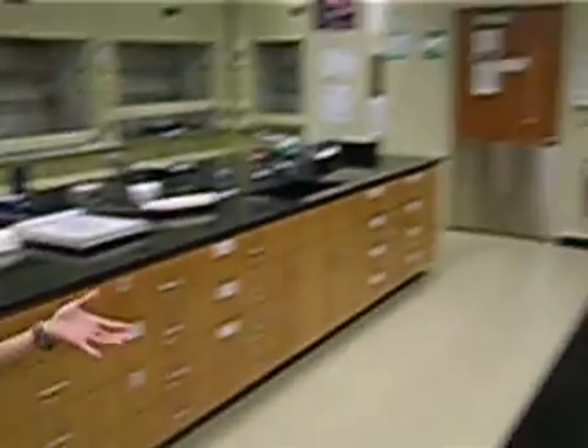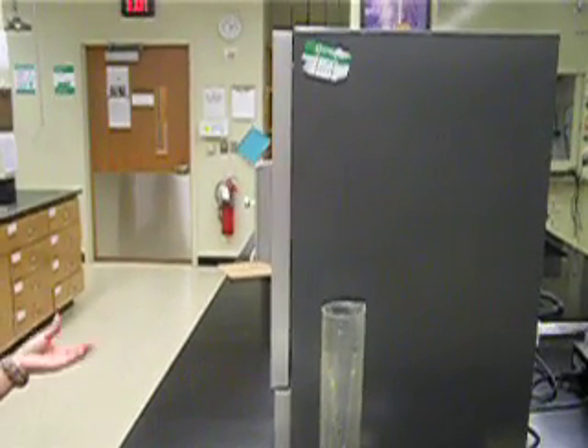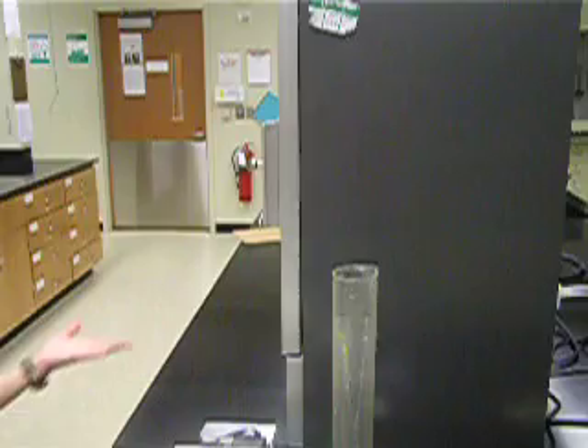Now we're going to move to the oven. This oven is used to dry out your glassware or your solids. At the beginning of your experiment, put your glassware in so it can dry. You can also dry out your solids at the end of an experiment.